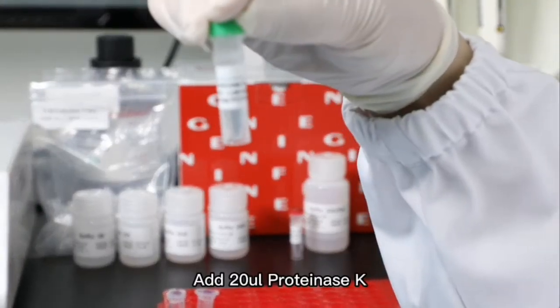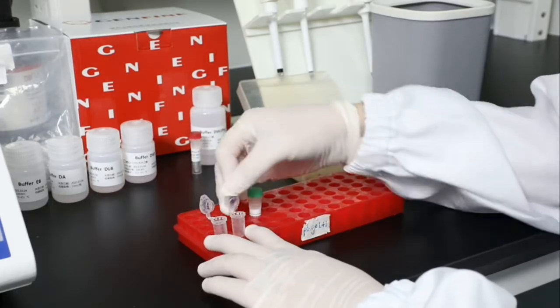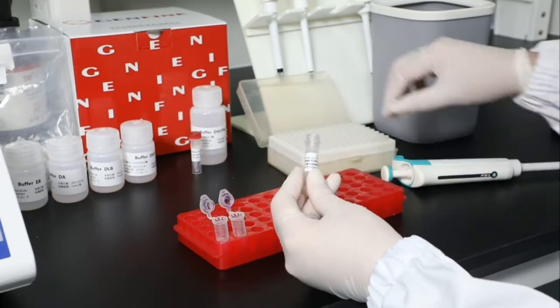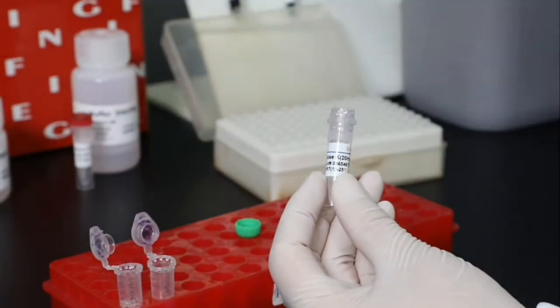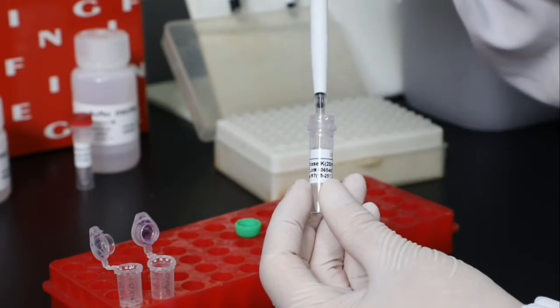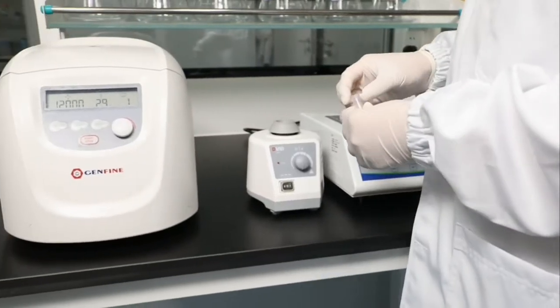Add 20 microliters of proteinase K. Mix well.